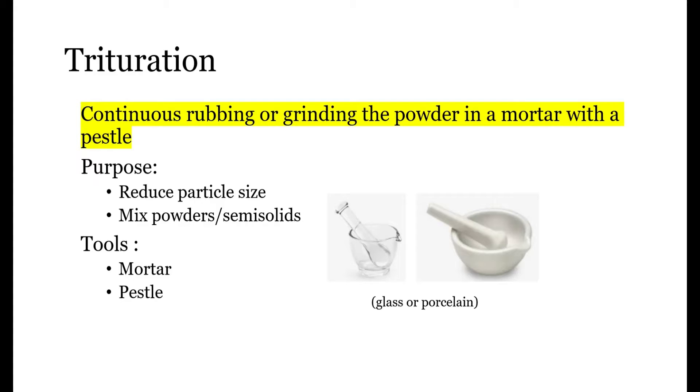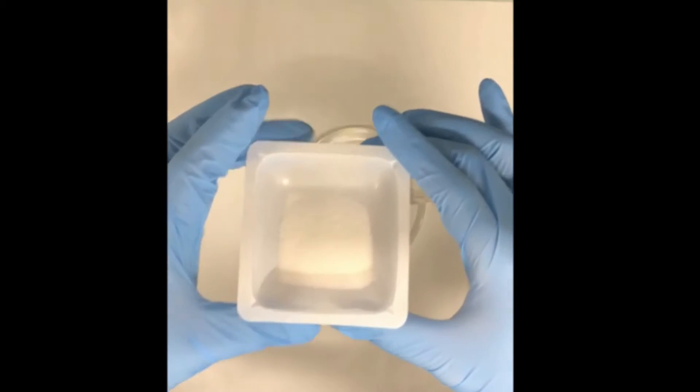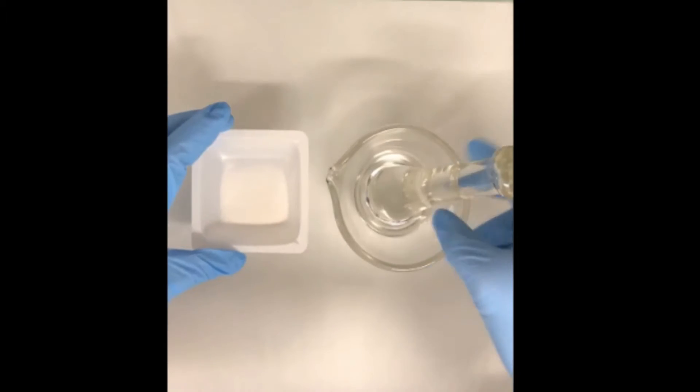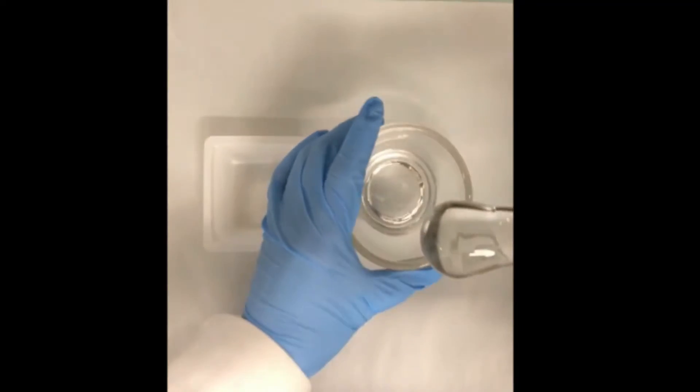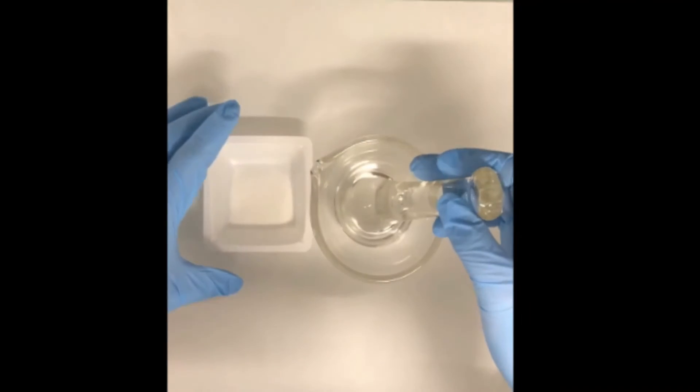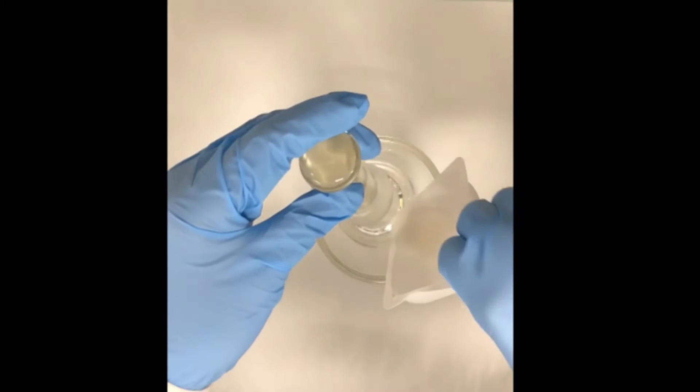Porcelain is more common. However, it is a good idea to use a glass one if you want to use some food color, because porcelain can be easily stained, which is very hard to clean. Now, I'd like to show you an example to trituration sucrose. In this case, we will use a glass mortar with a pestle. I'm going to place the powder in the mortar.